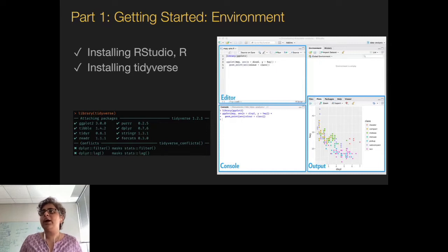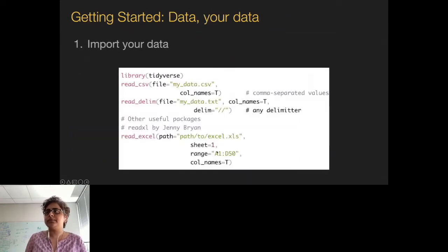Okay, so if you have RStudio and you're using the default colors, you might have noticed that mine looks black because most of my things are in black. I prefer that. So this is what your RStudio is going to look like. I'm guessing most of you are familiar with it, so I'm not going to dwell too much here. If you're installing Tidyverse and then loading it, if everything looks good, this is what it should look like. Again, the white version of it.